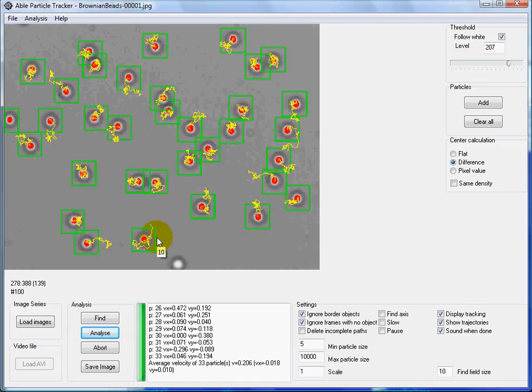And the results are also written into a text file in the same folder as images.